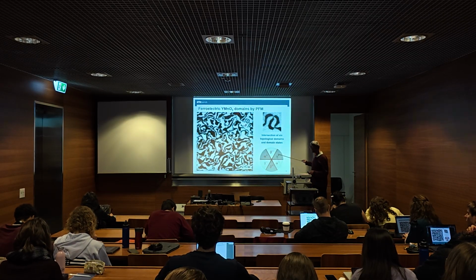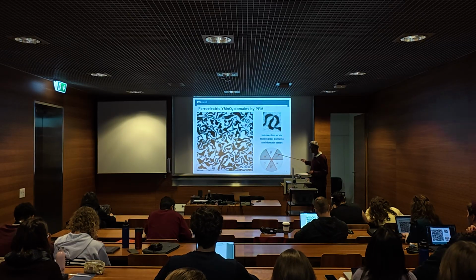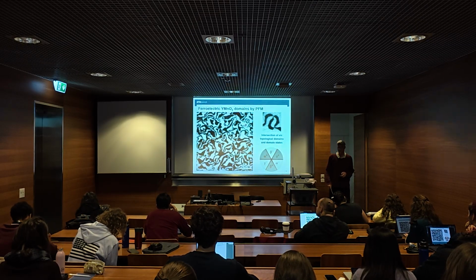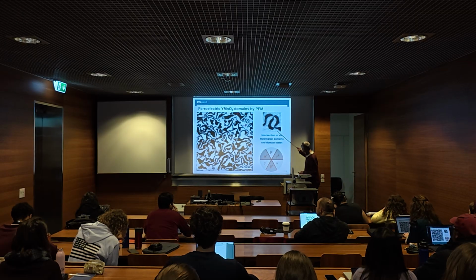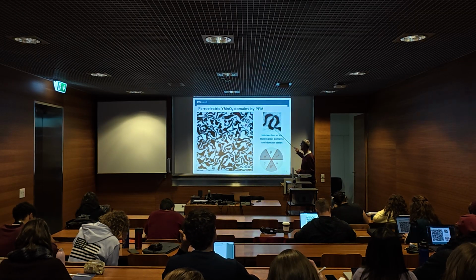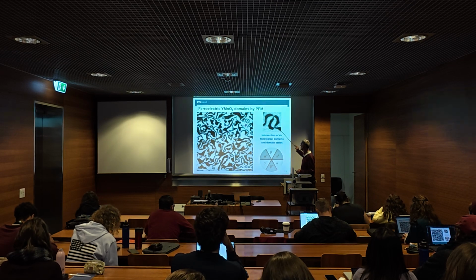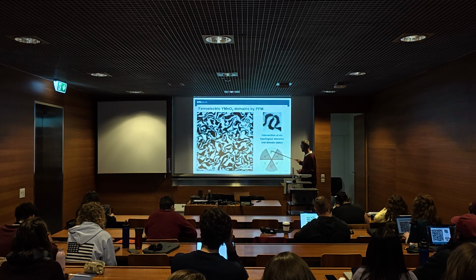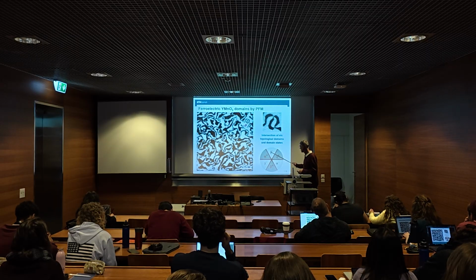And then this is what you see in the picture. So the plus, minus, plus, minus distribution of the polarization in fact reflects 6 different distortive domain states. So this one is different from that one. This bright one is different from that bright one. But since you only see polarization, you only see the plus or minus out of these 2 labels.